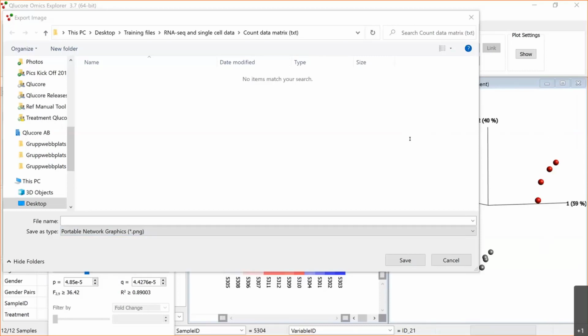So I guess you can do it there. I'm not sure about this specific question, allele balance alterations. But you are very welcome to have a look at the NGS module, which is also active in your trial license, and see if this is supported there. I can check this as well.